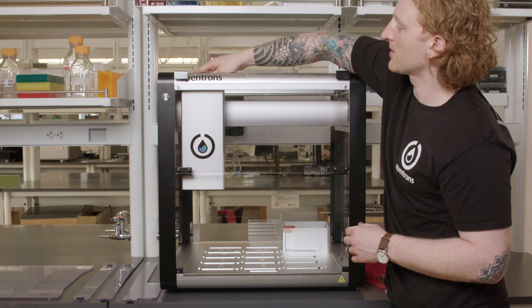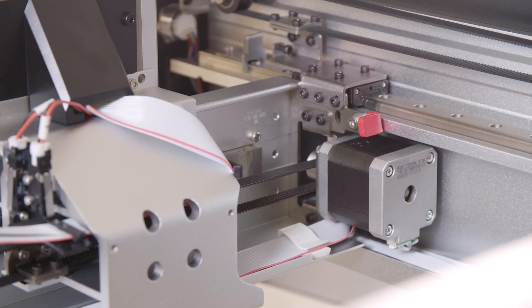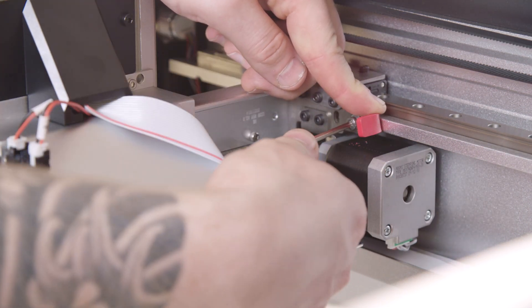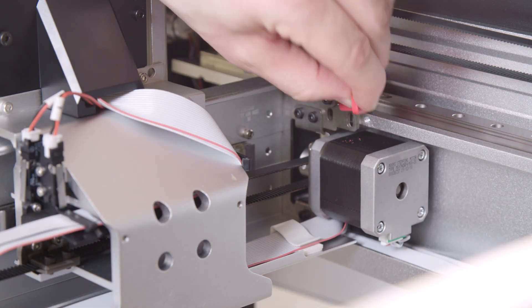The last locking bracket is the smallest. It is located on the left side of the robot opposite the trash at the intersection of the X and Y rails. Once this third and final bracket is removed, I will now install the top window and side panels on the OT2.